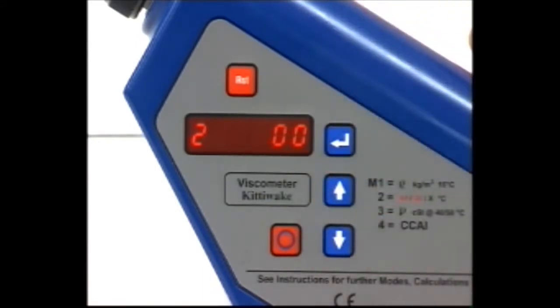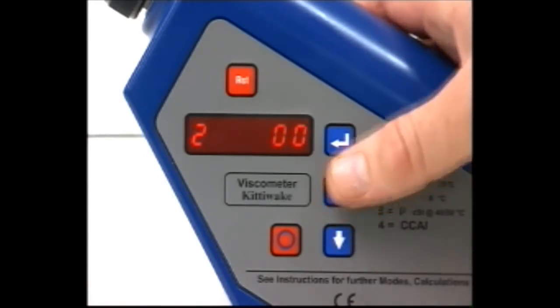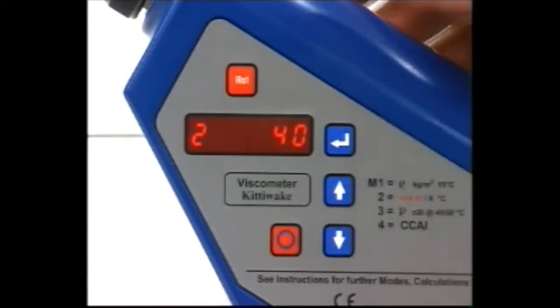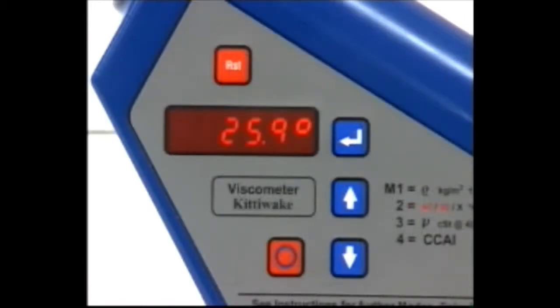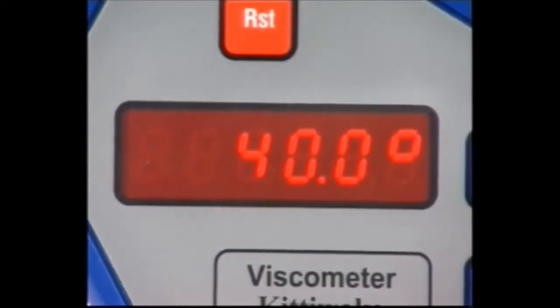Unheated lube oil corrected to 40 degrees Celsius, heated lube oil at 40 degrees Celsius, heated fuel oil at 50 degrees Celsius. Press Return to select the setting. The temperature display will flash as the oil is heated, and the degree symbol will flash until the oil temperature is stabilized. Because the viscosity of oil is so dependent upon its temperature, it is very important that the temperature in the viscometer is accurately controlled and allowed to stabilize.